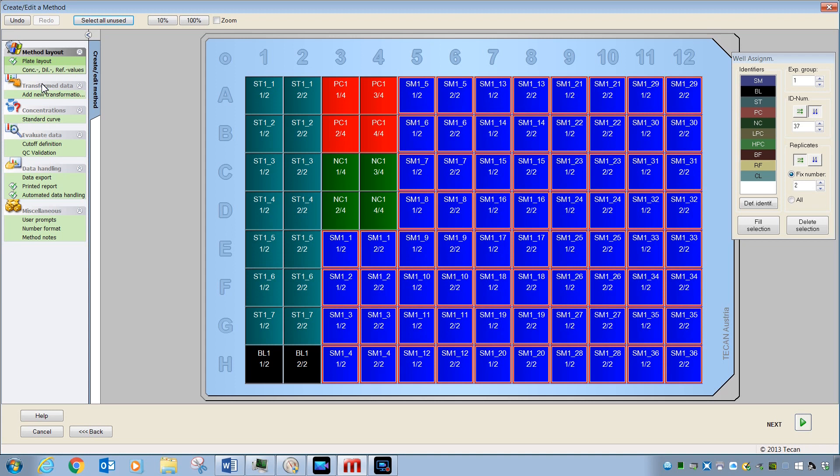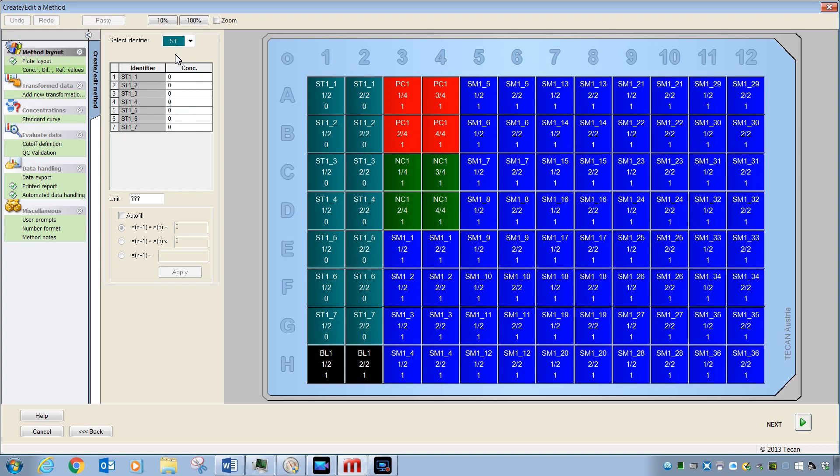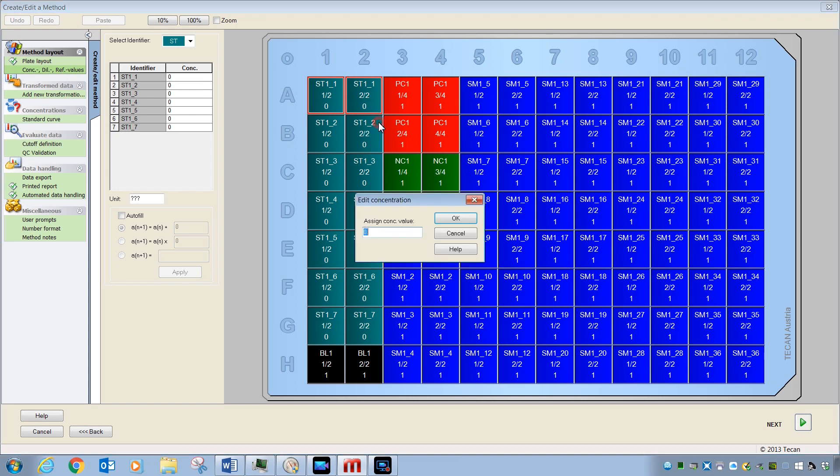Let's at least start with Concentrations, Dilutions, and Reference Values. It is here that you can select an identifier and enter the dilution or concentration for that identifier. In this case, we have standards. We could type in the dilution here or come over here into the screen, click and drag, then right-click, choose Edit, and enter a value in the field like so.